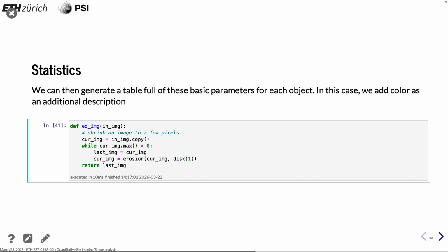We do some statistics, but to do this kind of statistics, we may not want to use the whole image. So the first pre-processing would be to erode it, shrink each car to a minimum, hoping that the central point or the central eroded point is representative for its color.